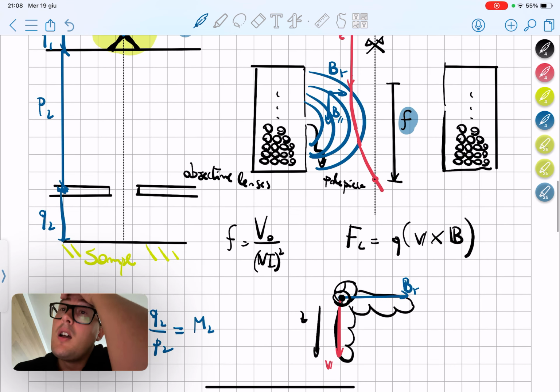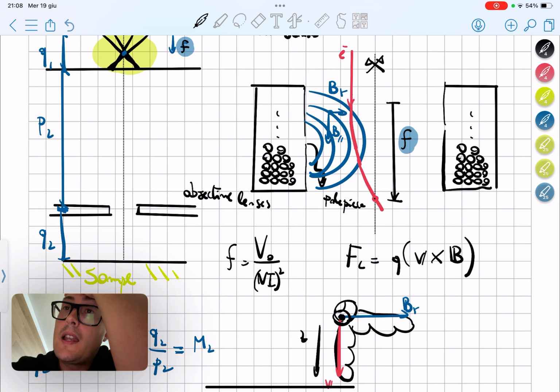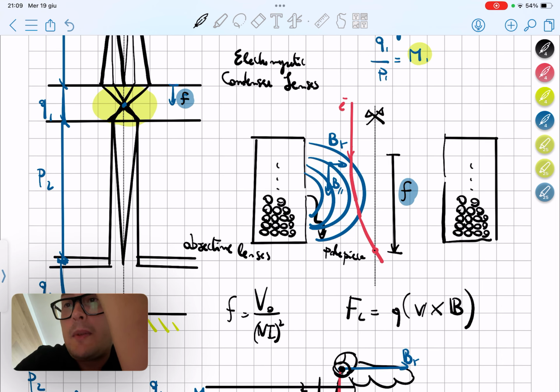So what has happened to our beam? We have an important convergent angle, like this, and a diverging one. So you can tell that the one coming here proceeds, and this one proceeds, and this is all lost.